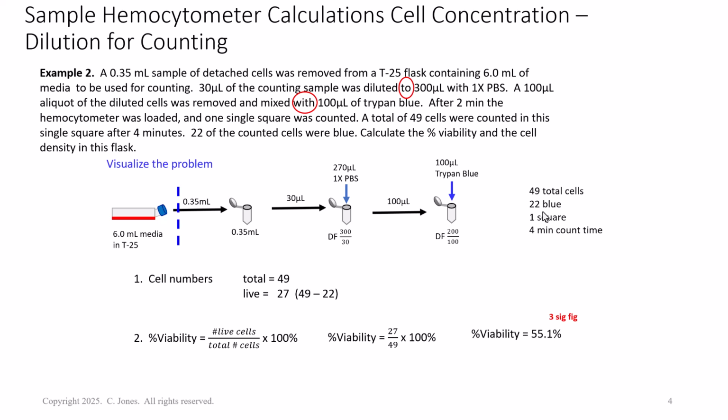We would start to think about doing a root cause analysis to figure out why the viability is so low. All right, and some cells inherently have a low viability, but we would try to figure out why this viability is low. Did we wait too long to passage? Was there a change in the incubator conditions? What are the things that could have gone wrong? So again, when we see low viabilities, we start to get a little bit concerned.